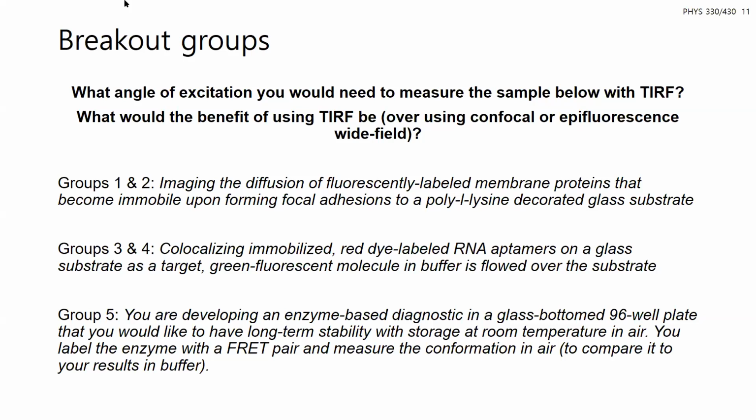using water is close, but since these are membrane proteins, I guess I should have made it a little more clear that since they're in a membrane, I was thinking more in a cell, where the refractive index is a little bit higher than water. Something like 1.37 in a cell; the cytosol can range a little bit, but 1.37 is a good approximation, but also water is pretty good. So it'd be about 67 degrees or higher than that. And I apologize for not listing that it's in a cell with this one.